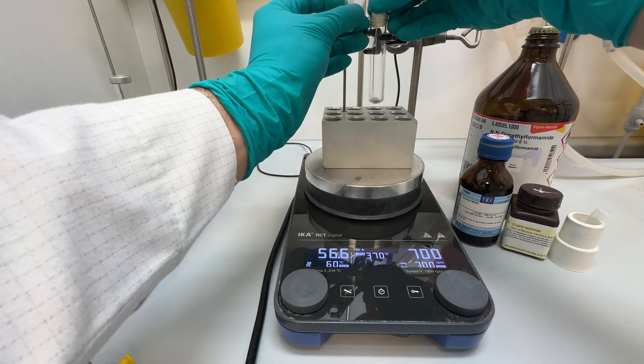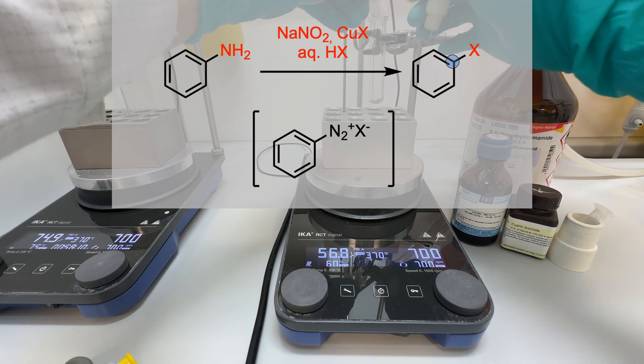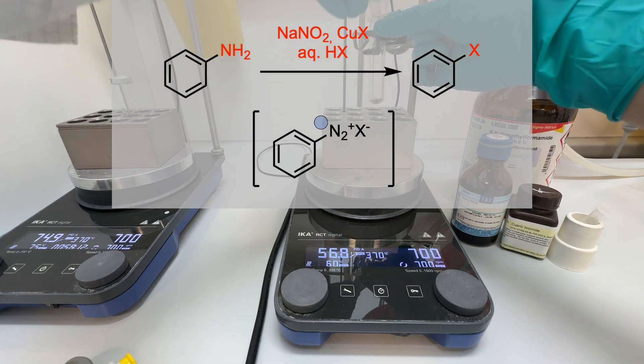I set up a Sandmeyer reaction. The Sandmeyer reaction is often used to prepare aryl halides from aryldiazonium salts using copper salts.